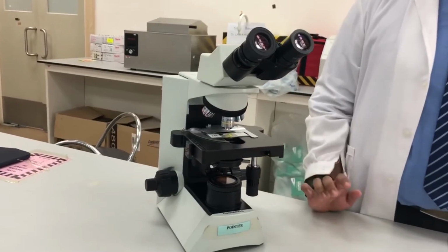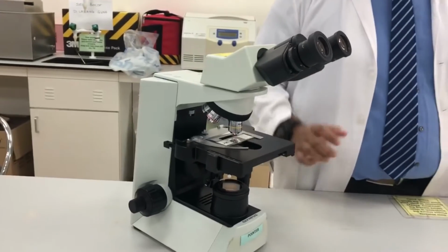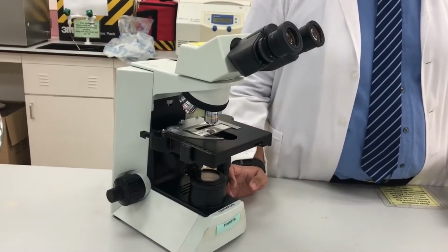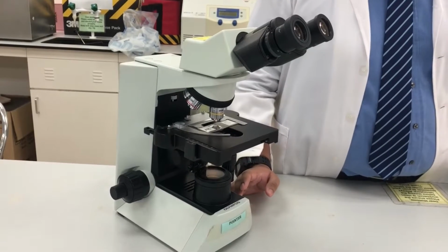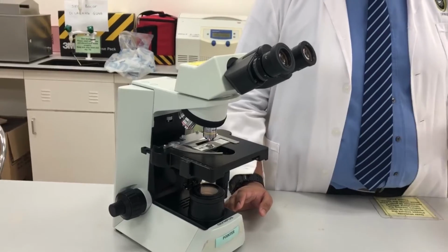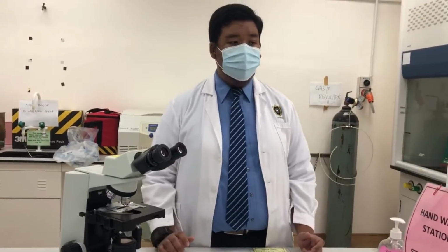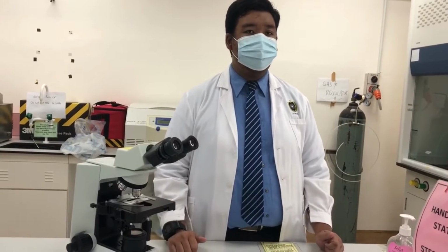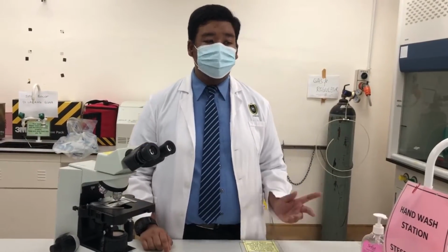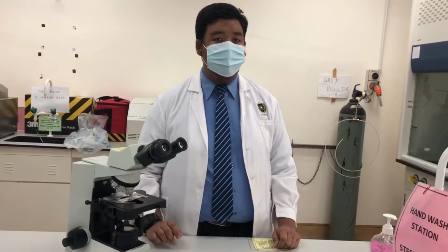The third one, the arm. This is the part connecting the base to the head and the eyepiece tube to the base of the microscope. It gives support to the head of the microscope and it is also used when carrying the microscope. Some high quality microscopes have an articulated arm with more than one joint, allowing more movement of the microscope head for better viewing. Okay, next, my member Azrizal will discuss more about the optical parts of the microscope and their function.